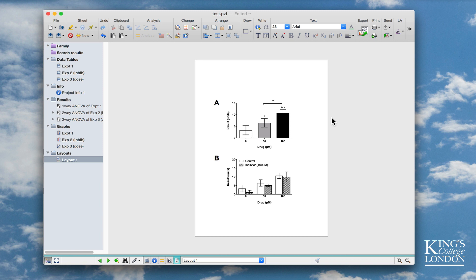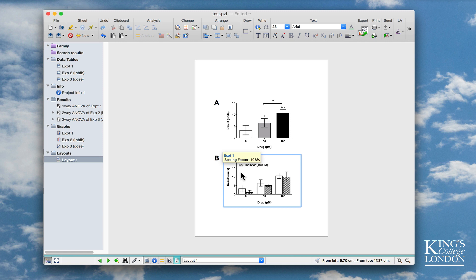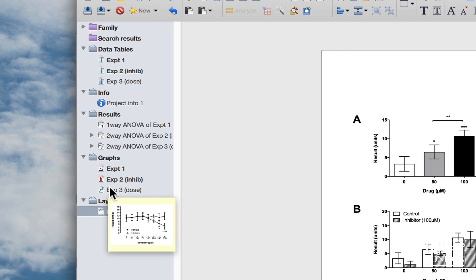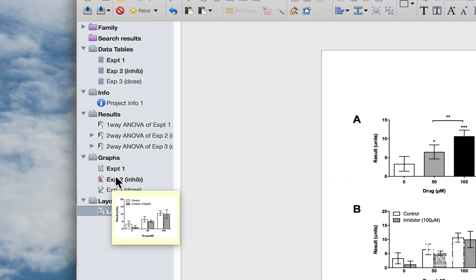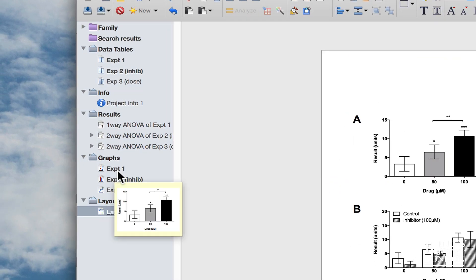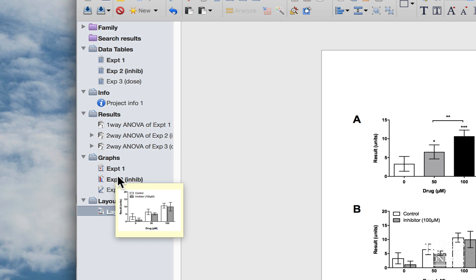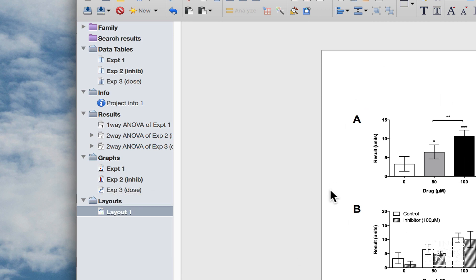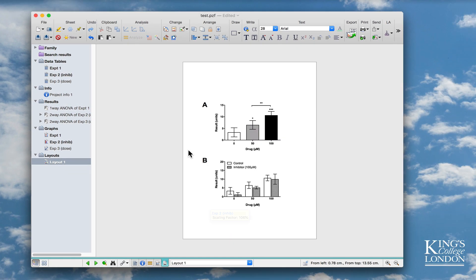What we've got on the screen is Prism version 7, and I've got a file loaded from my demonstration selection on which I've created a layout with two graphs. Here's graph A and graph B. Graph A and graph B are taken from my graph collection, which is listed here on the left-hand side, and I'm showing the data for experiment 1 and experiment 2. I also carried out experiment 3, but you can see here that experiment 3 is not in bold because it does not appear in the layout.